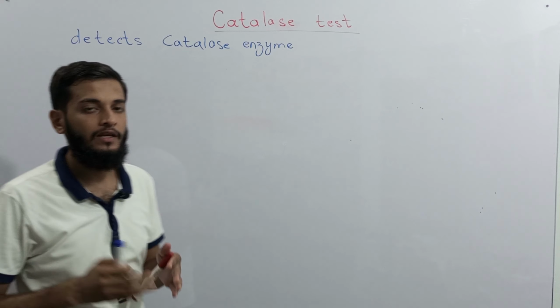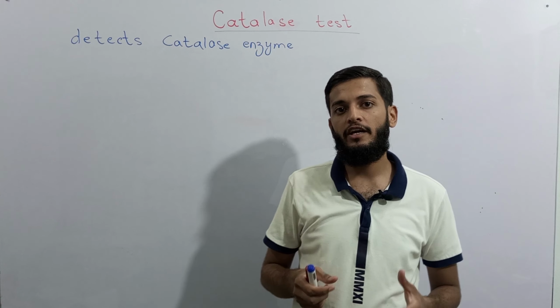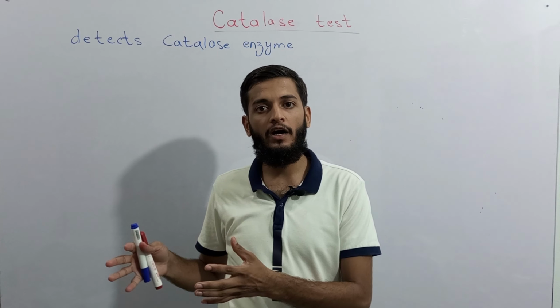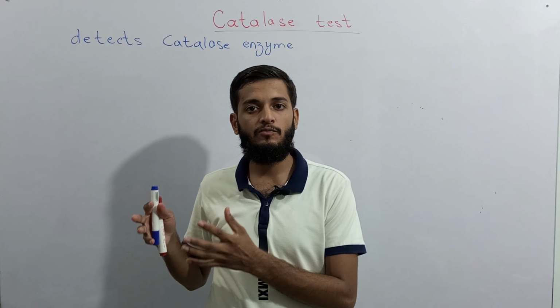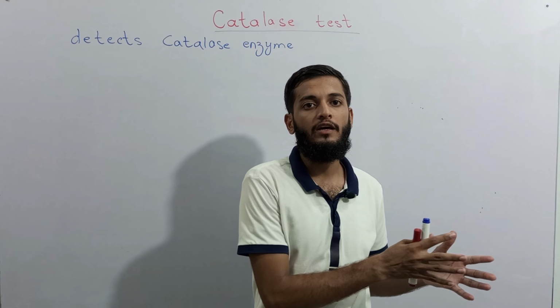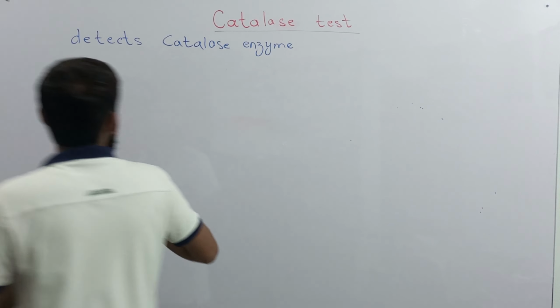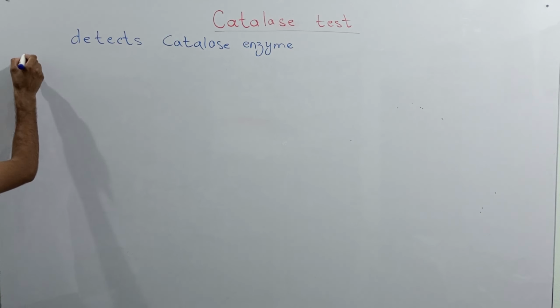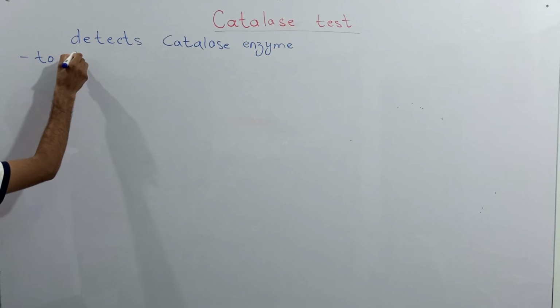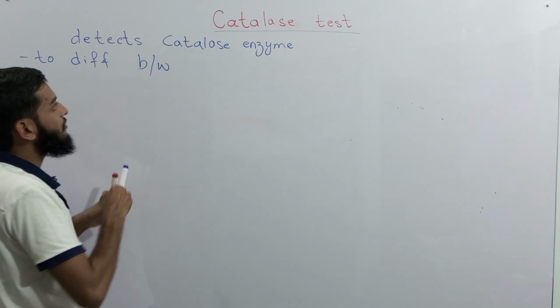Most commonly, catalase test is used to differentiate between staphylococci, which are catalase positive, from streptococci and enterococci, both of which are catalase negative.